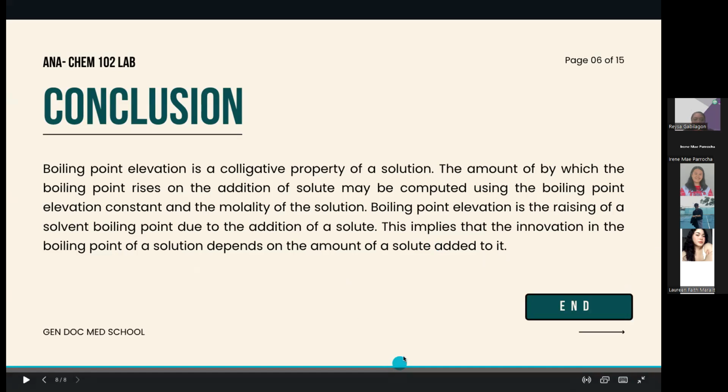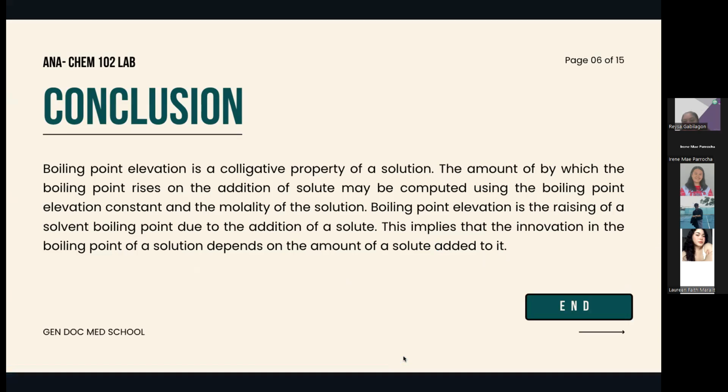Okay. Question muna. Why do you think your actual result in the experiment is not really the same as your computed theoretical values for the boiling point? Have you researched about that?